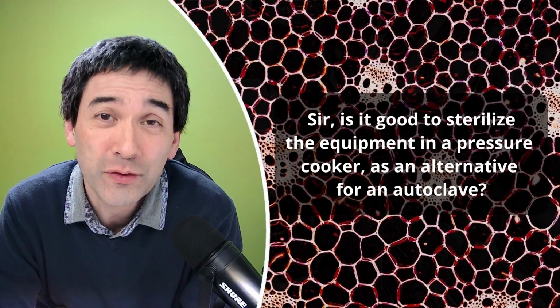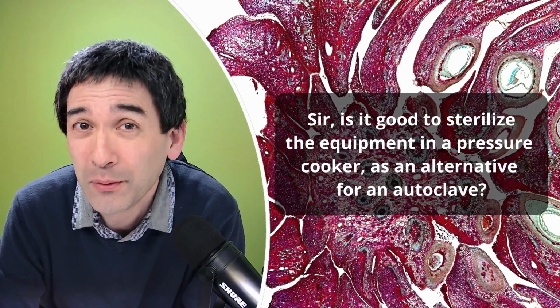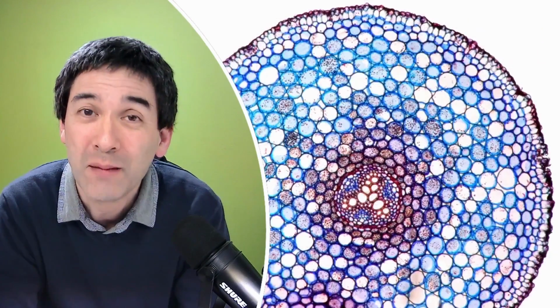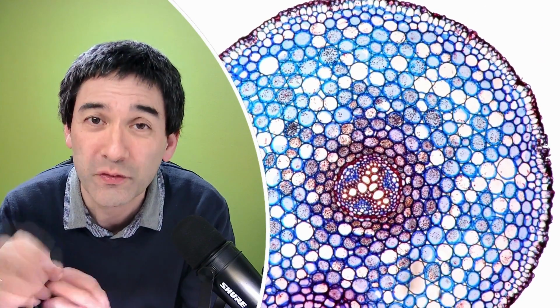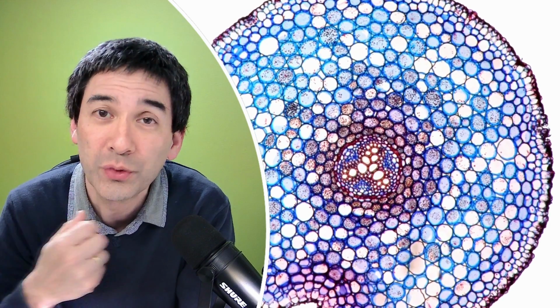Well, the question refers to one of the videos that I made where I put a fungus from a rotting orange under the microscope, and I've grown the fungus also in a petri dish. So I cultivated the fungus deliberately so that I've got an easy method to obtain a sample for microscopy, because under the microscope I wanted to observe the spores of the fungus and also how they start to grow. So this is kind of the context here.